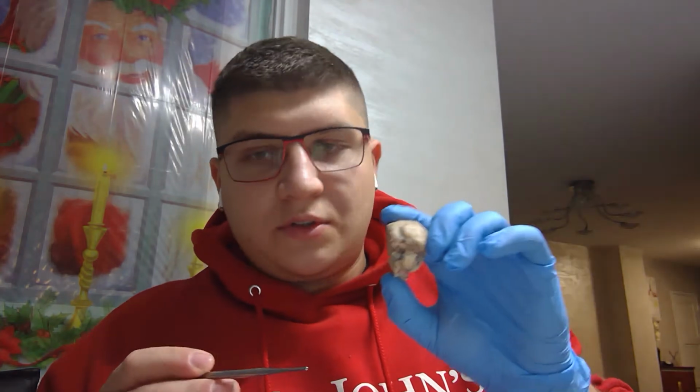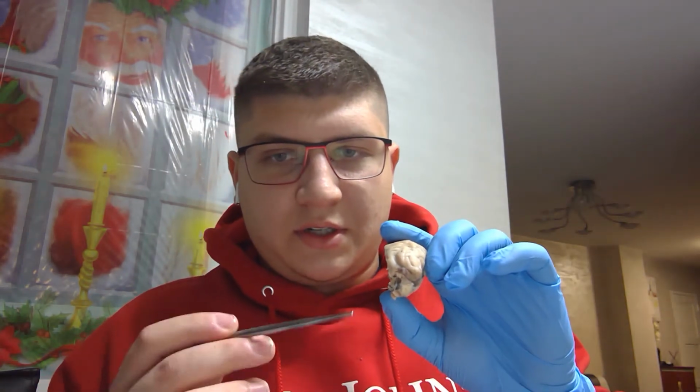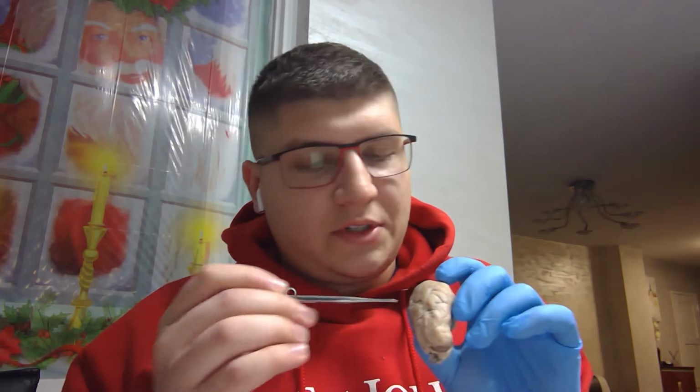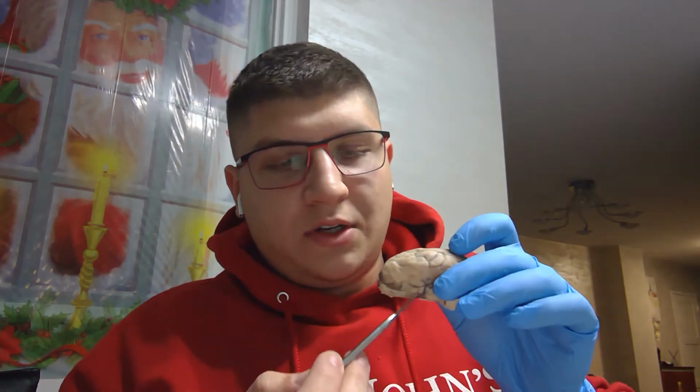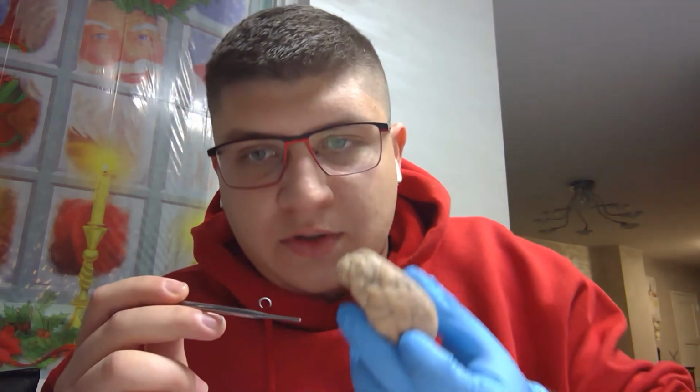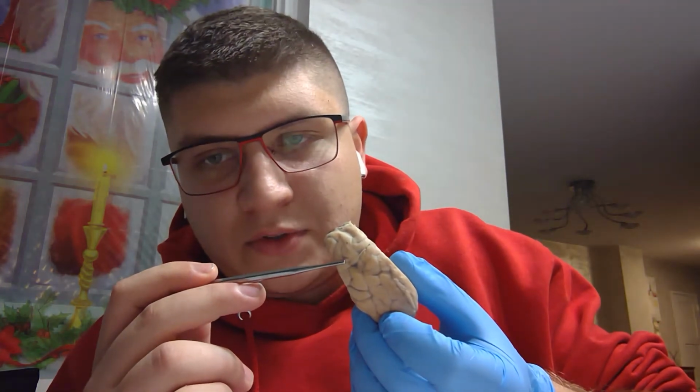We're going to start off with the frontal lobes. This is looking at it facing forward. Right in the front is your frontal lobe. On top is your parietal lobe. This is just the left side, just pointing it out. On the bottom is going to be your temporal lobe, and on the back is going to be your occipital lobe. If you look on top, you're going to see the ridges and the folds.